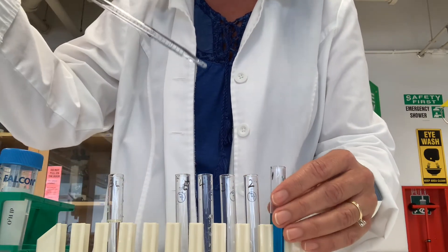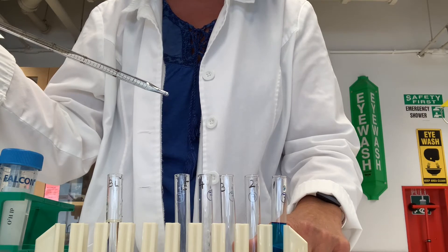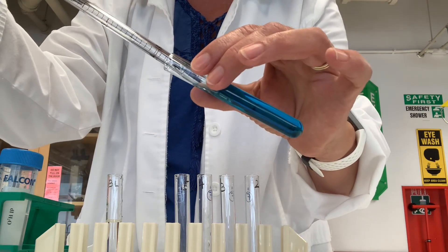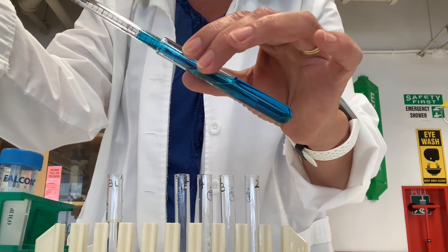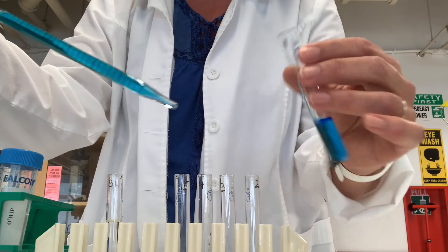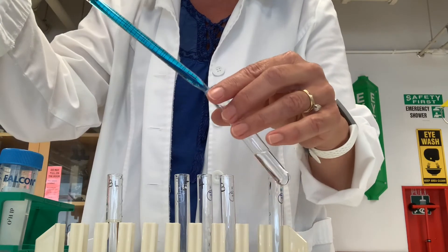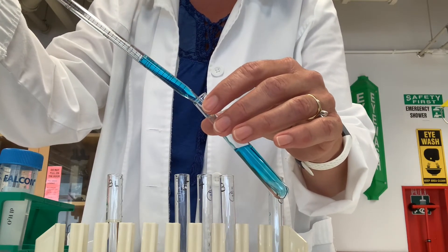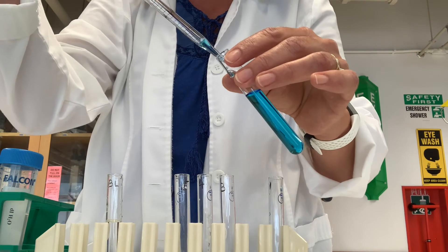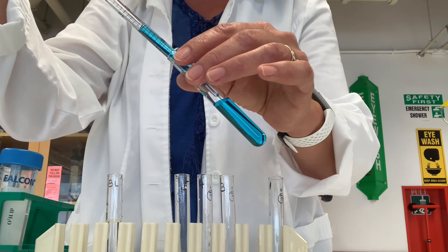In our serial dilution, we're adding three milliliters of dye from tube one to three milliliters of water in tube two. I'm only immersing the tip in the liquid and draw out three milliliters, going to the two milliliter mark. I expel that into tube two. You'll notice it's not mixed well, so I gently pipette the liquid up and down a few times to make sure it's mixed, then expel everything out.